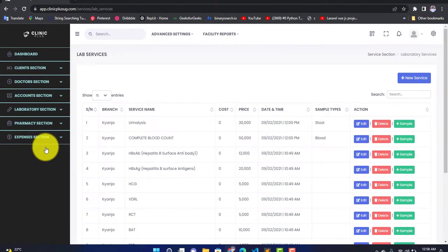After clicking on it, you are going to get this interface where you can add more and more lab services. Now, if you didn't watch the previous video — in the previous video we saw how to add laboratory service categories — go back and watch that video first, because we are going to depend on those categories to add services. You select a category and add services under that category.